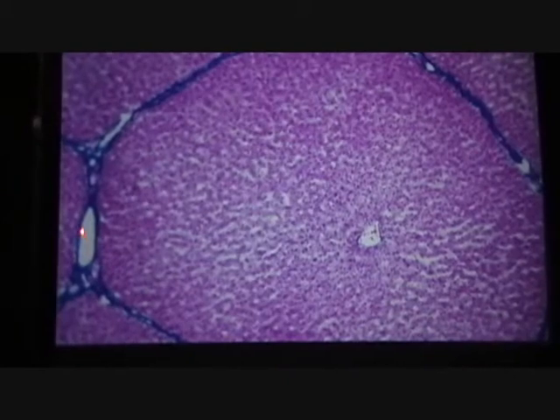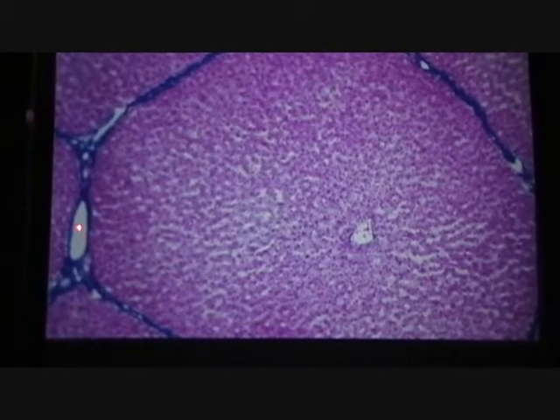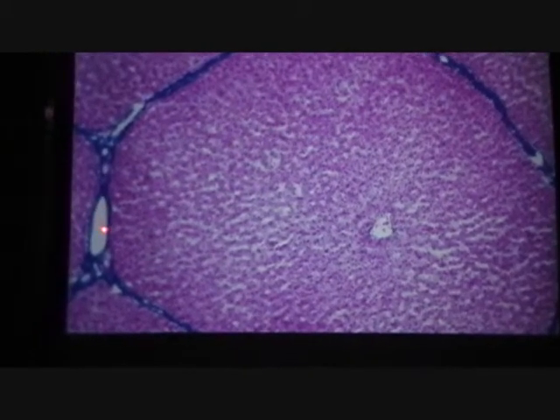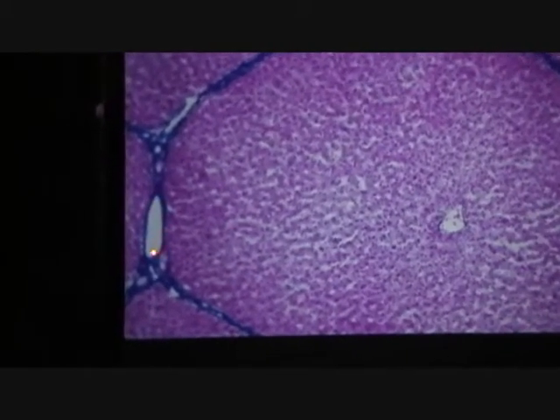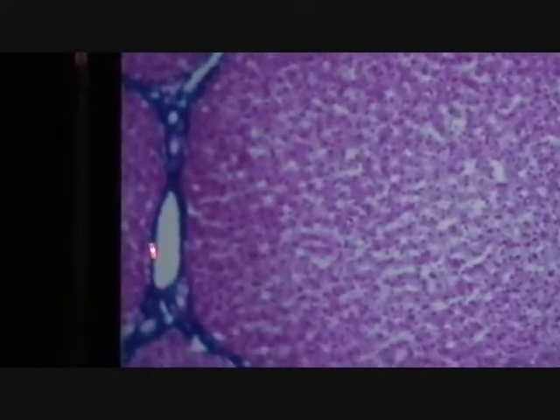Now here, I wouldn't ask what tissue it is, I would ask what structure is that? Which then you would tell me what tissue it is by knowing that structure. What would you call that opening? Should be unmistakable. Portal vein, all the way. What's this? The central vein, right in the center of the hepatic lobule. Blood is gushing from here to here.